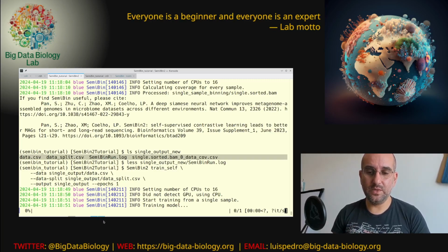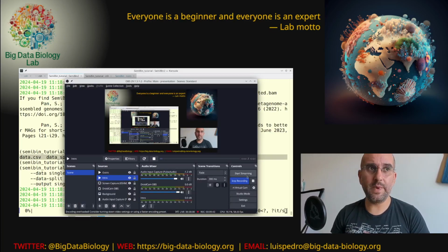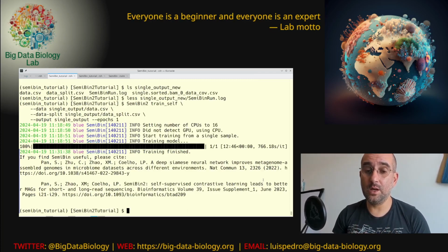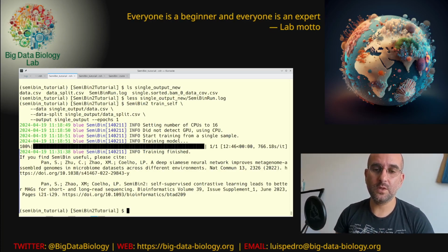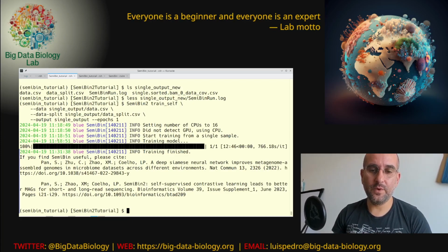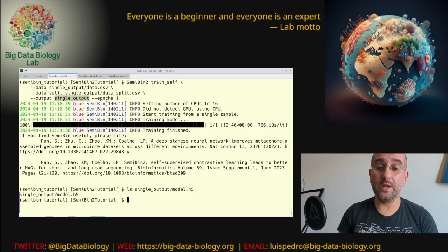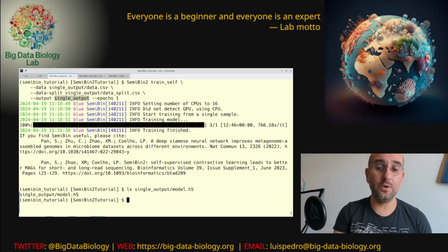So what I'm going to do is I'm going to pause the recording and I'll be back in a couple of minutes to get back to you. And welcome back. So we're done. Here, you can see the timestamps went from 18 to 31. So it took about 15 minutes to run, more or less. And now this will have output this model file, which is a file that you can now use on the same sample or on other samples.